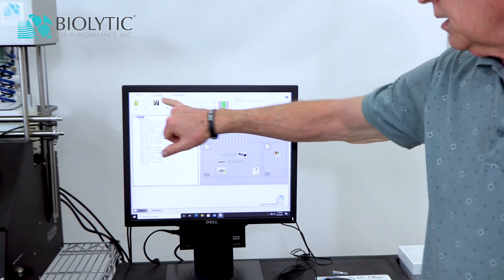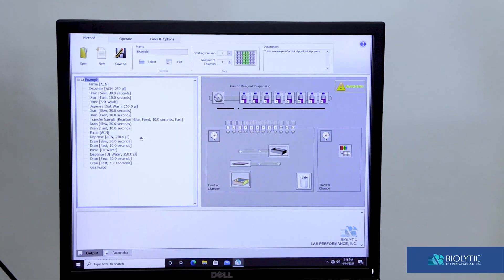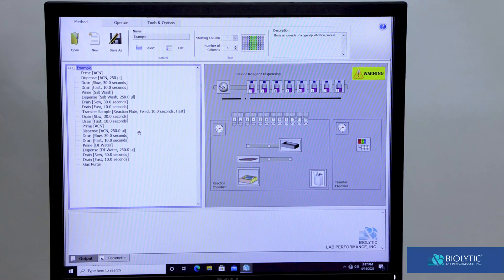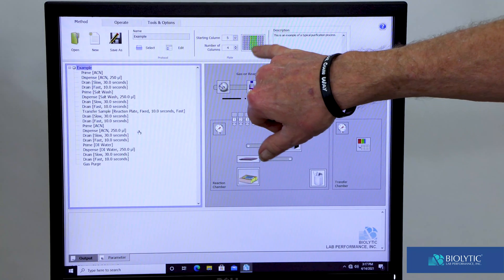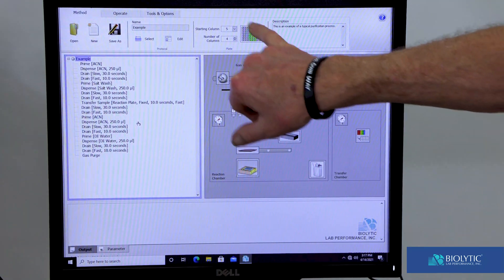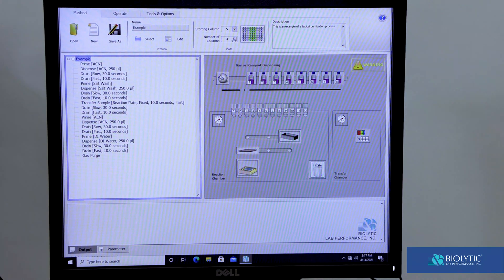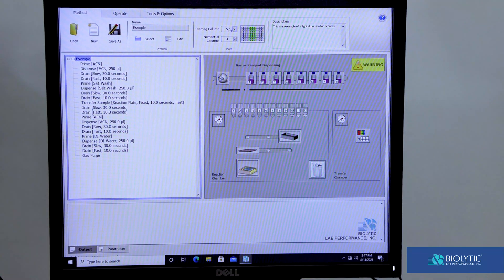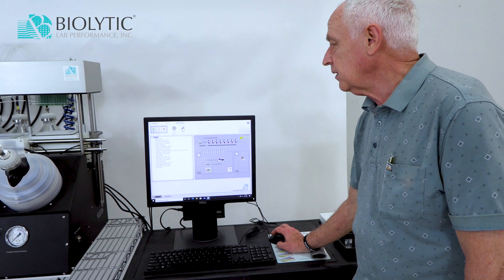This is what the software looks like when it opens. We have three tabs across the top: Method, Operate, and Tools and Options. Method is what we actually run when we make a run — a method is a protocol plus a set of wells that we want to work with in today's run. Right now we have four columns selected starting on position five, but we can change that to anything we want. We can start on position three or position one, which is typical, and we can run any number of groups of eight that we want.